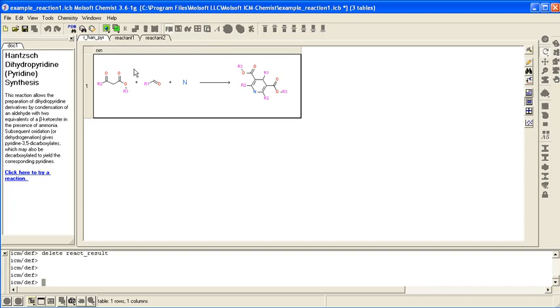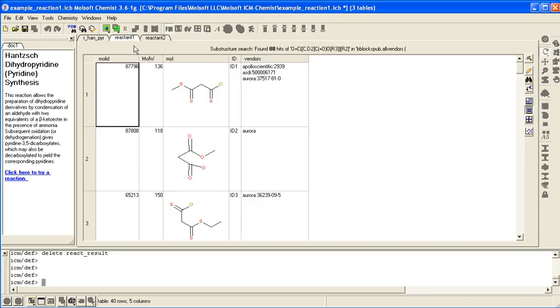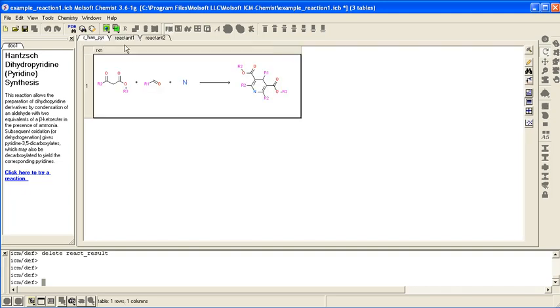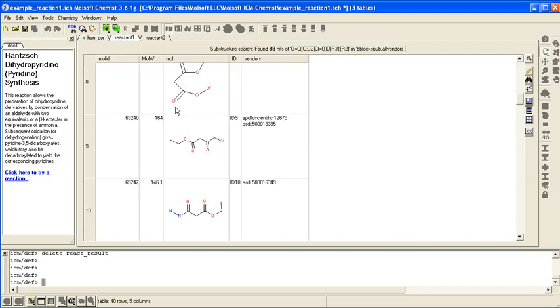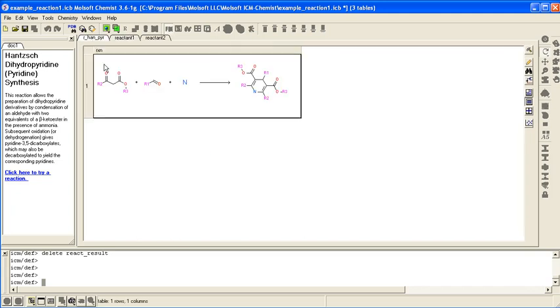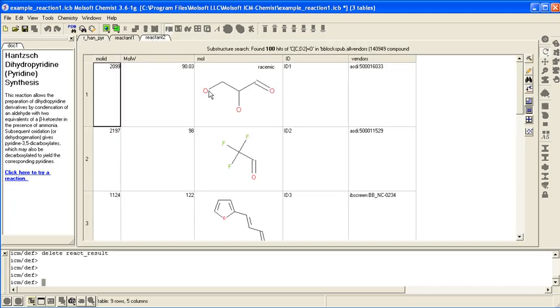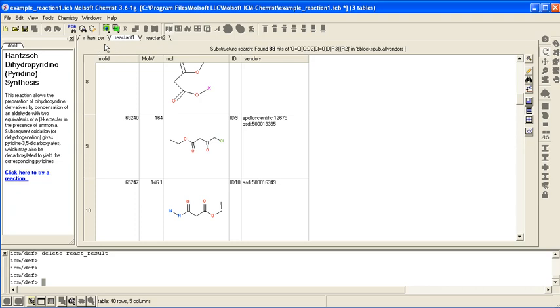Then you also need to define the reactants for reactant 1. So you have a database of fragments for reactant 1 with R2 and R3. This is reactant 2 which is just a similar substructure.